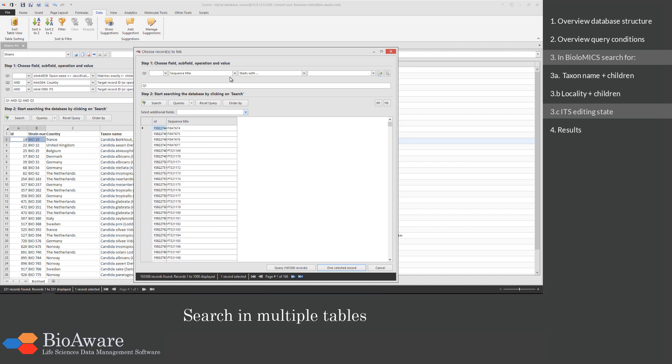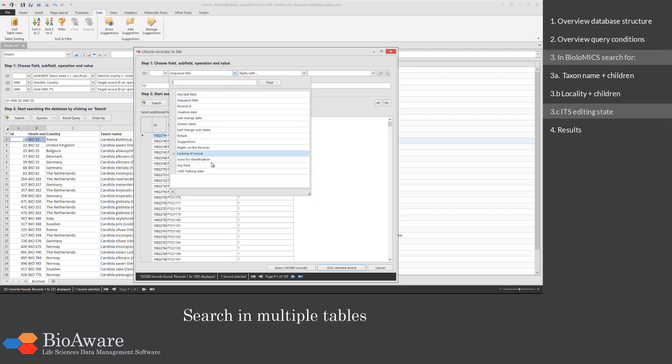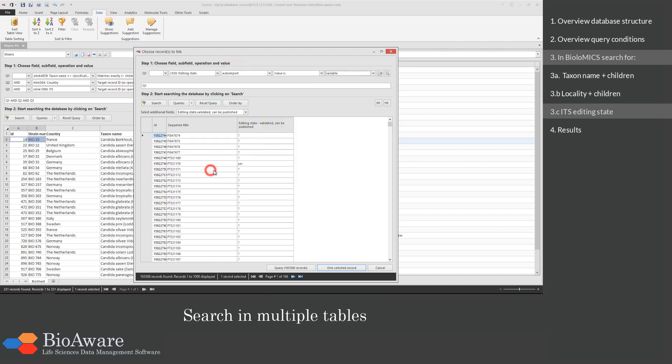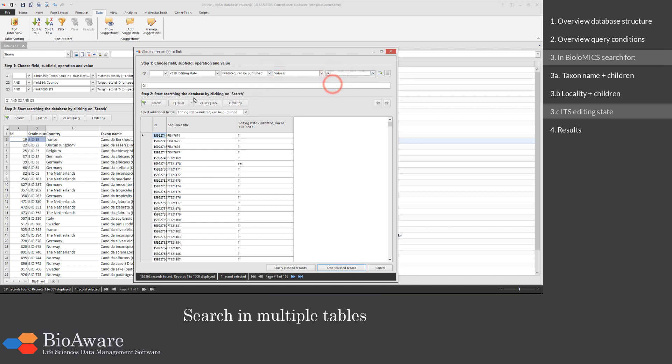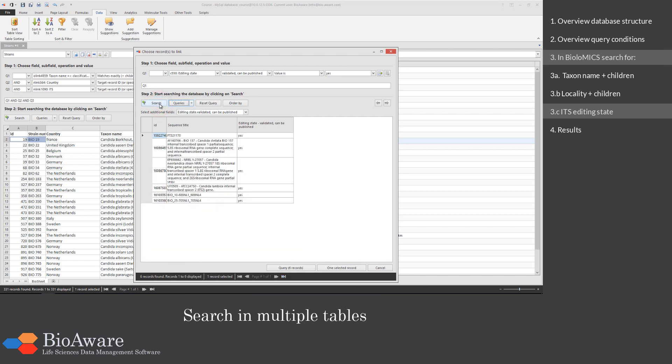Then search for that specific field where the value is yes. There are six records found in total and we will add them all to the query.